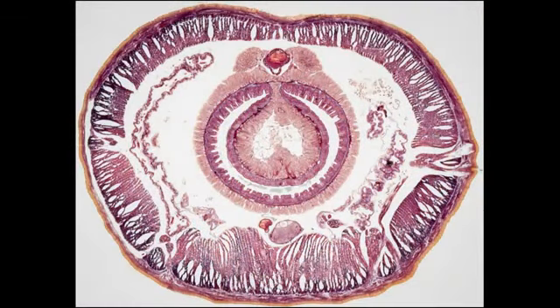Now, compare it to this microscope slide of a cross-section of a real earthworm. This slide is available to you in the laboratory. All the same parts are here, and in the same relative positions. The outer layer consists of the cuticle and epidermis. Just beneath that is the circular muscle layer. Here is the longitudinal muscle layer.